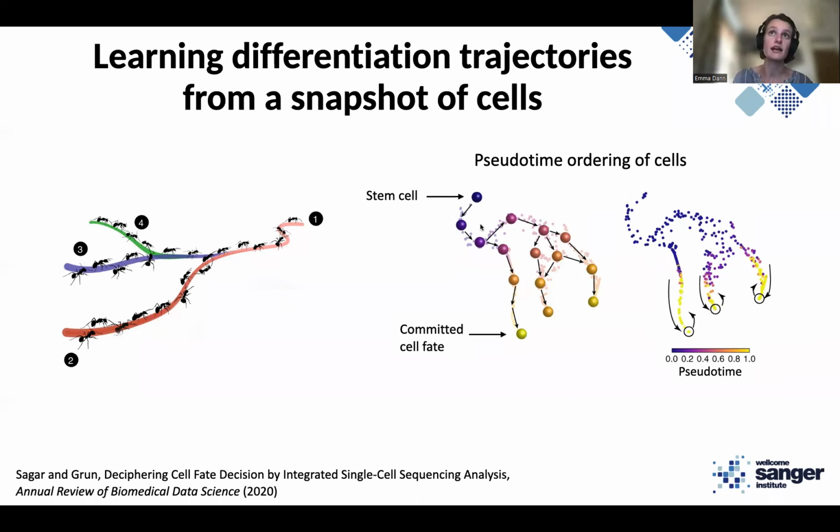If we have identified with marker genes a cell that is a stem cell or a progenitor cell, and we start walking along the graph from these cells, where are we likely to end up? This average of random walks is frequently used as a method to order cells in pseudotime that frequently represents differentiation trajectories.